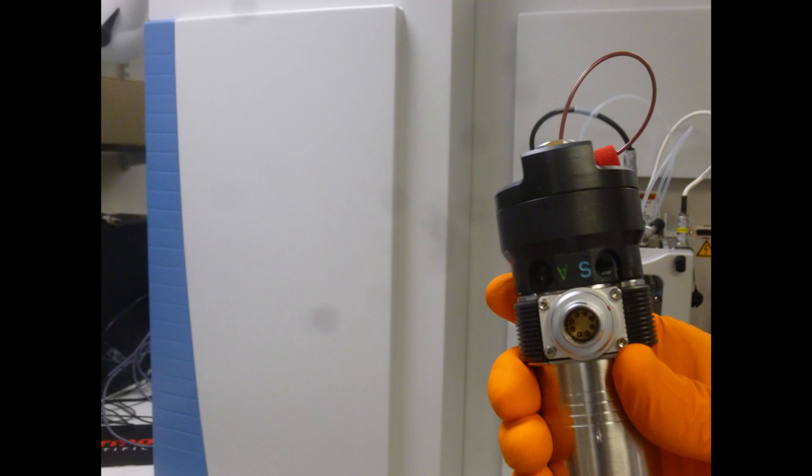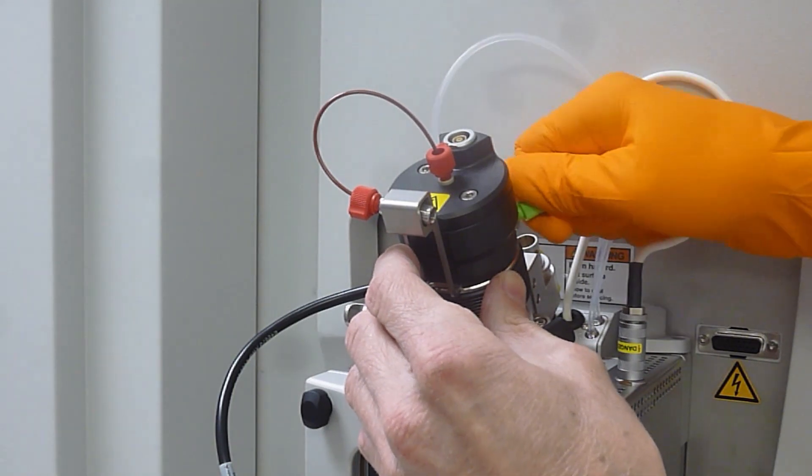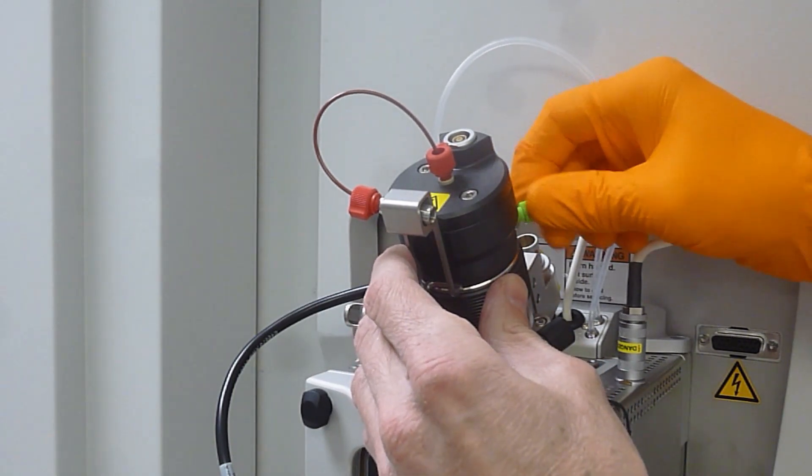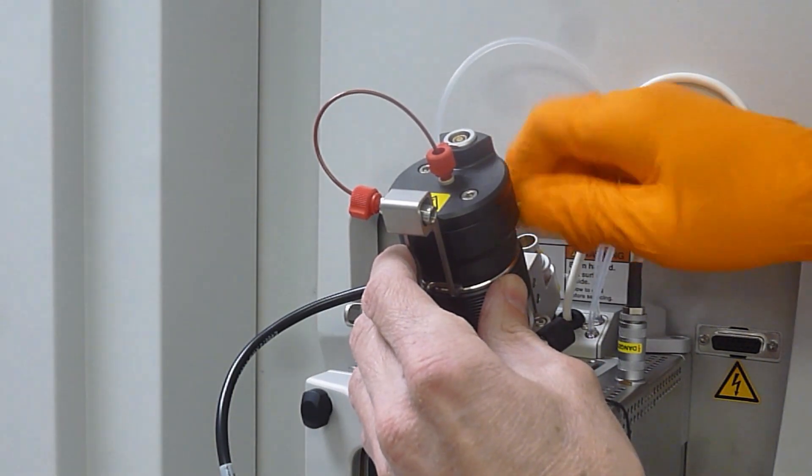If you have any confusion about which way around they go, check the engravings on the probe itself to see if they match those on the instrument. Fit the green tube. They can be a bit of a fiddle to get at the right angle.